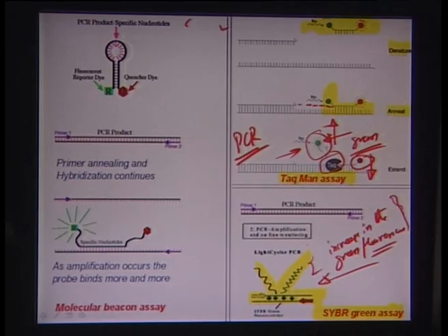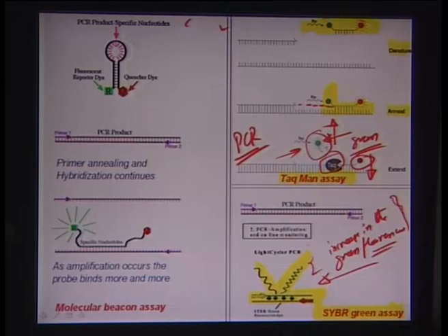As the reaction proceeds and the DNA grows and these enzyme steps are repeated again and again, there is a huge increase in the green fluorescence over the red fluorescence, and that demonstrates the success of the PCR process. So, this is essentially a very interesting way of detecting whether the reaction is going on successfully.